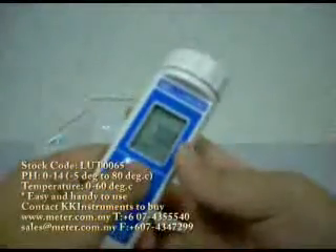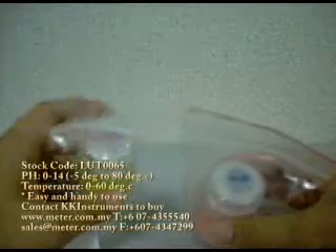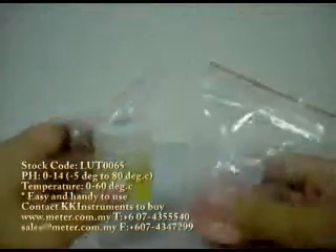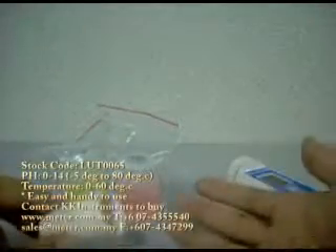We switch it off. This unit also comes with 2 free calibration solutions — one is pH 4 and one is pH 7. Besides that, you will also get a manual to teach you how to use this unit.